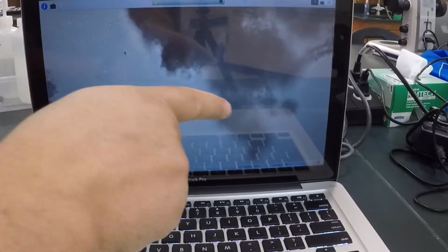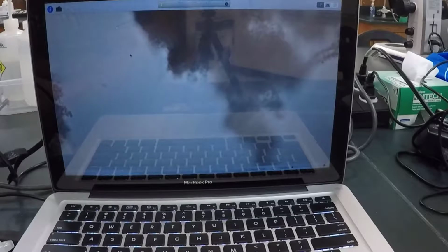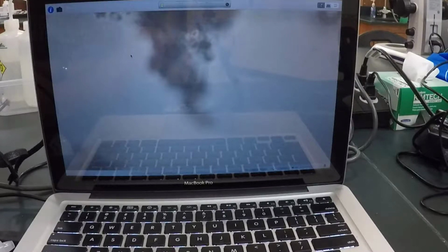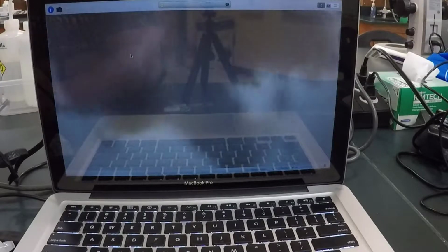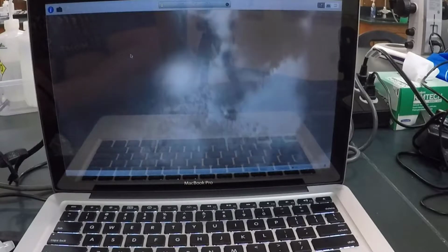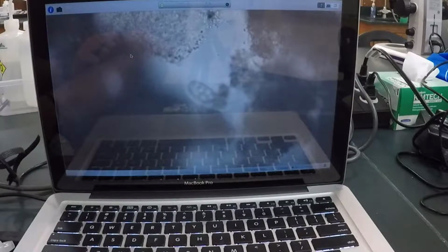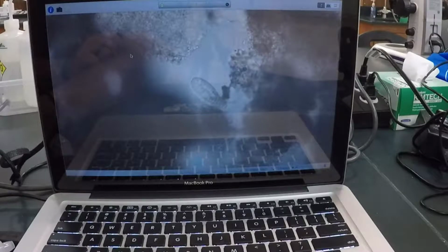You can see one here that's kind of moving around. It was stuck, but let me see if I can find another one that isn't moving as quick. And once they get stuck, then you can get a better look at them and analyze them and identify them. So here's one up here, right there. Okay, I'm going to focus in on this guy so you get an idea what that is.